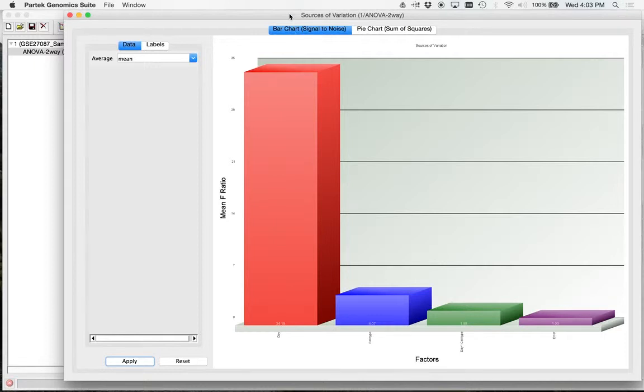With the cell type, you saw at day 0 those cell types are in the same kind of three-dimensional space, so they're not really different. The biggest variable in that whole thing, when you look at that graph, is day 0 here and then day 5 way over here. It's a difference between maybe a pluripotent and an embryonic cell, which are kind of similar, versus an embryonic cell and an endoderm cell.